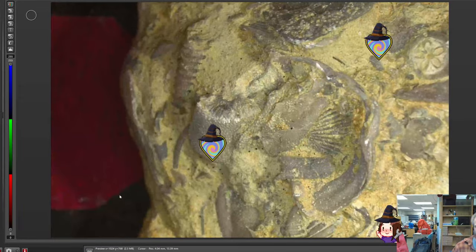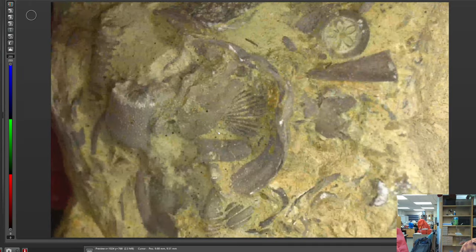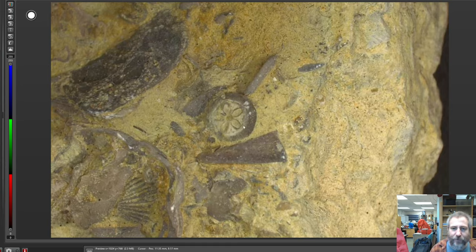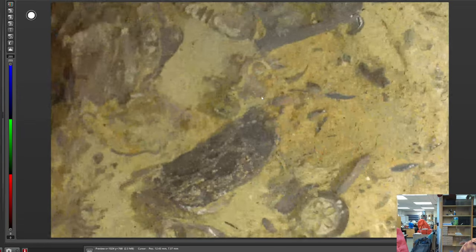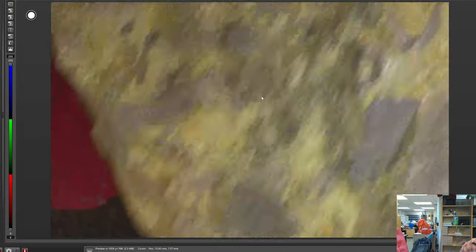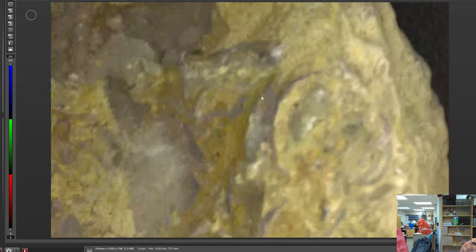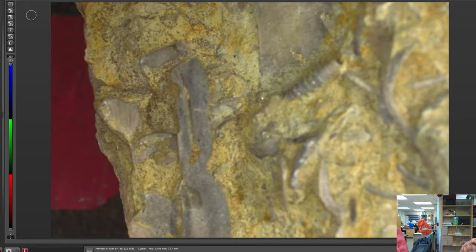But those are some pretty cool stuff. Those are corals right here. That's a coral for sure. And that's a brachiopod in the center there. Oh, that's a really beautiful, let's see, what are they called? Blastoid, I think. This is a type of crinoid with this little flower shape in the middle of it. Pretty neat. Yeah, it's a bunch of the same fossils, you know, they just all died in the same place. And then this is a bit of a shell hash, so the fossils aren't pristine. And that's the hinge right there. That's a hinge of a brachiopod.